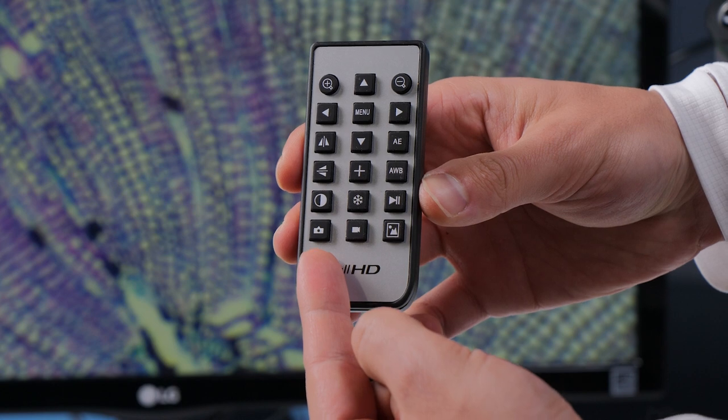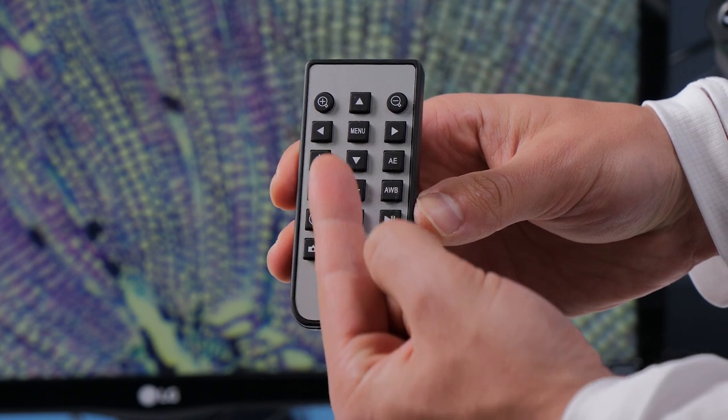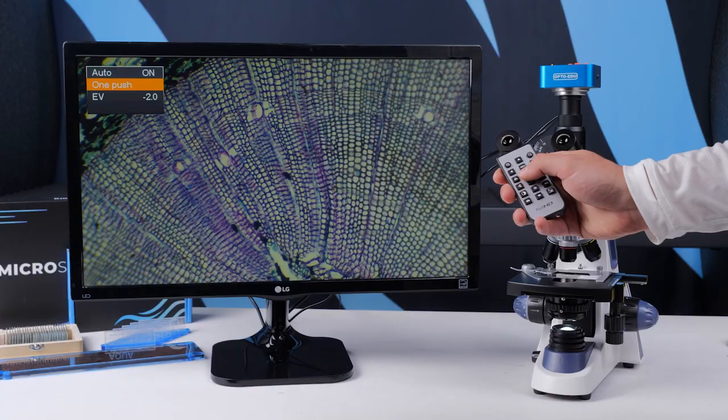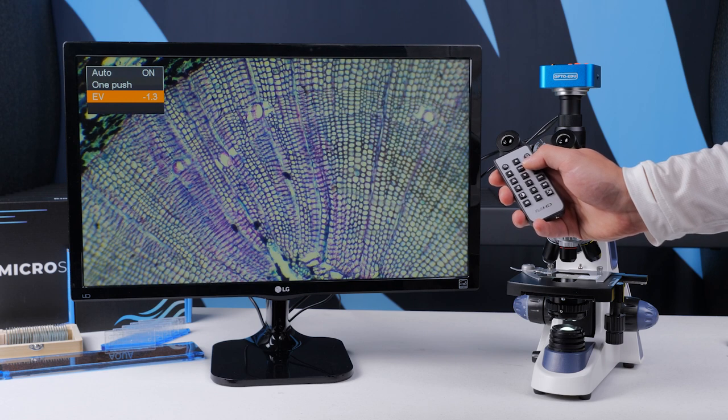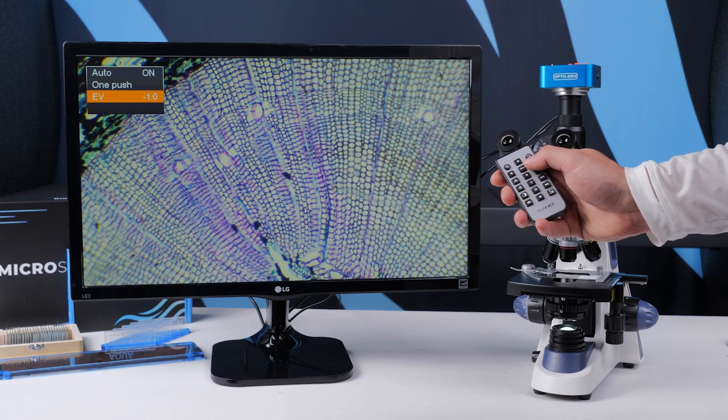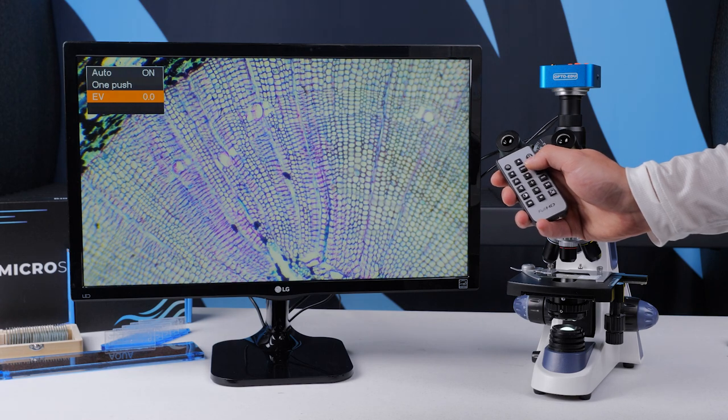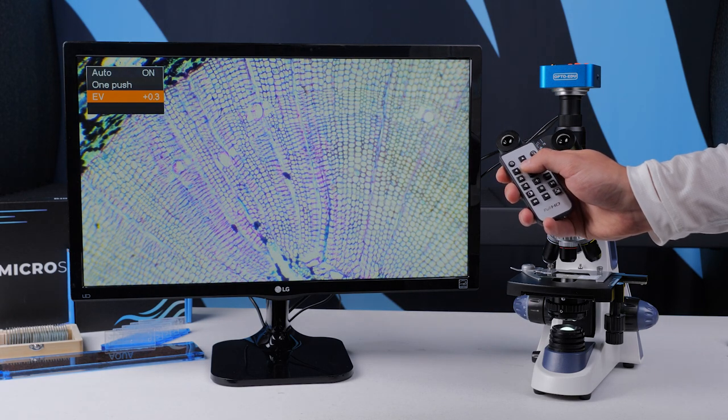Use the included remote to control the camera, take photos, videos and adjust settings to match your sample. I found that the out of the box settings on the camera are actually pretty good but it's worth going in and playing with the settings both on the camera and on the picture settings in your TV to get the best image for your microscope.